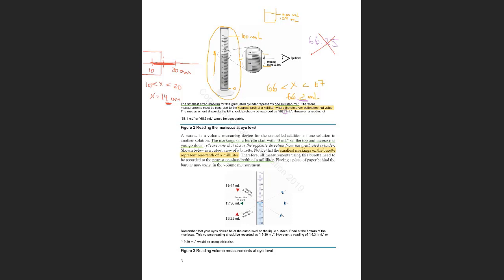Okay, that makes sense. So if you are using an instrument that has more markings, then you can guess one more and you will have more decimals. And we actually will go over that. But then if I use an instrument like we did before, I always do this at the beginning, and I say, what do I know?